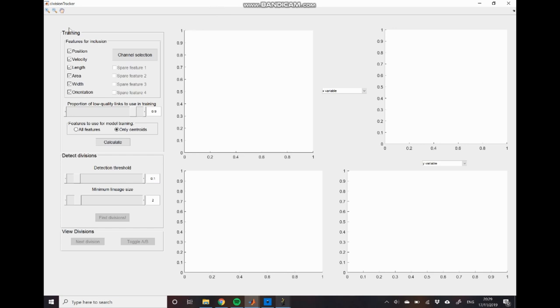So again we have this stage where we perform training of a model and then we have a detection stage where we actually perform the main division detection which uses the information from the training stage to optimally integrate information from across many different features.